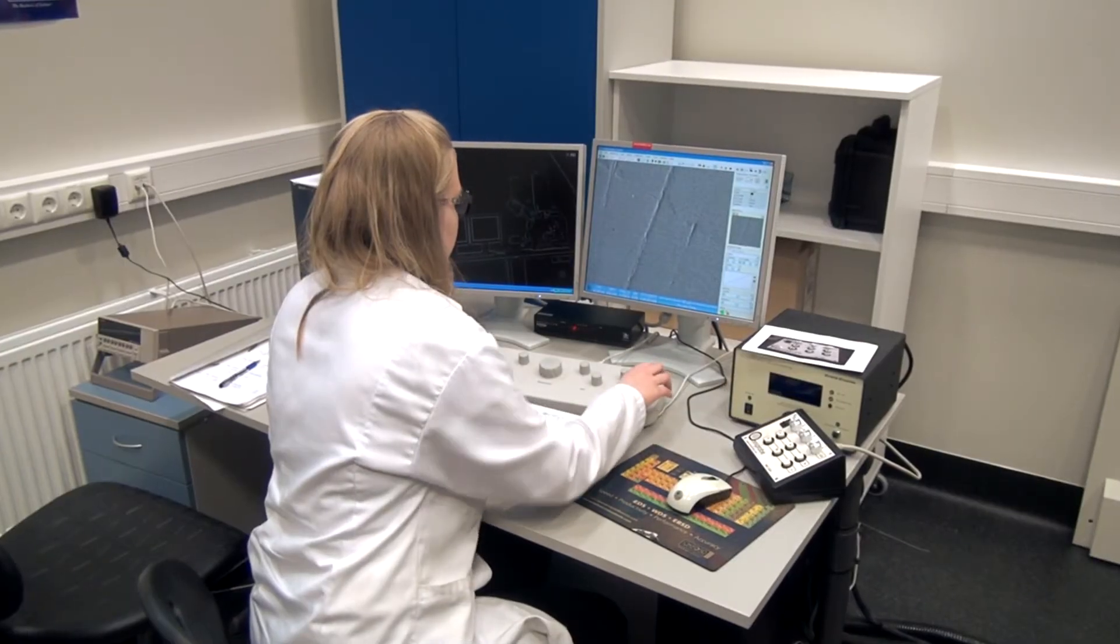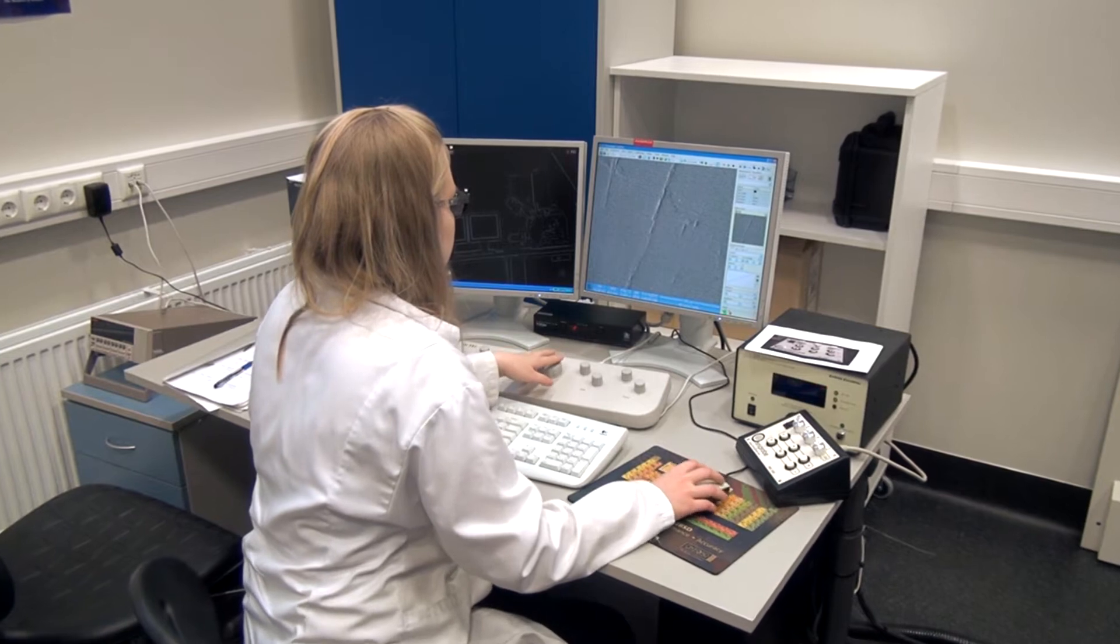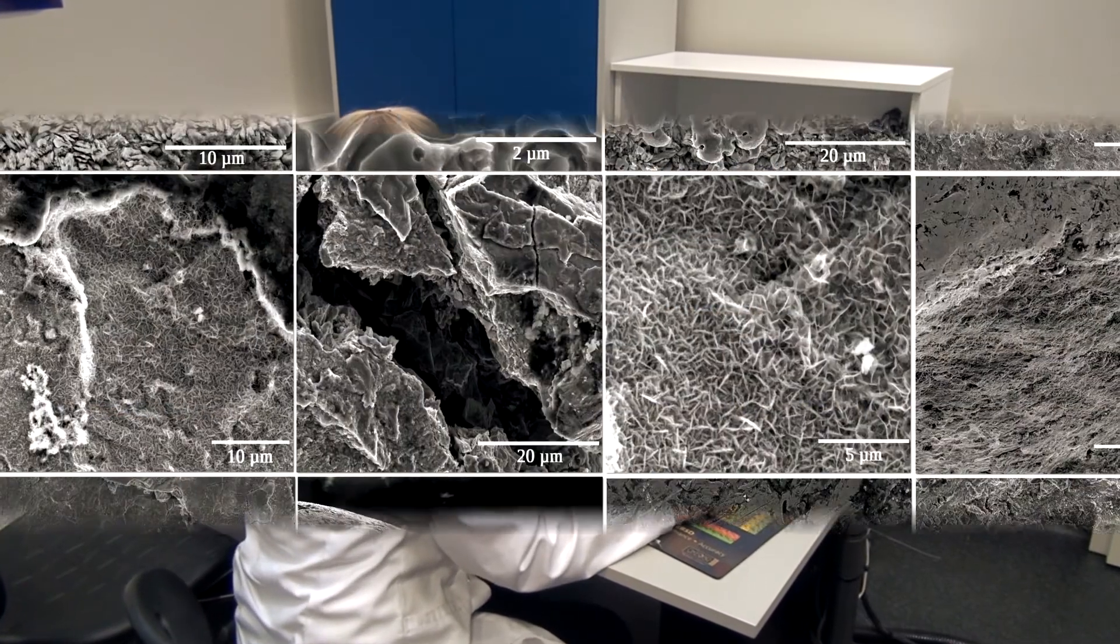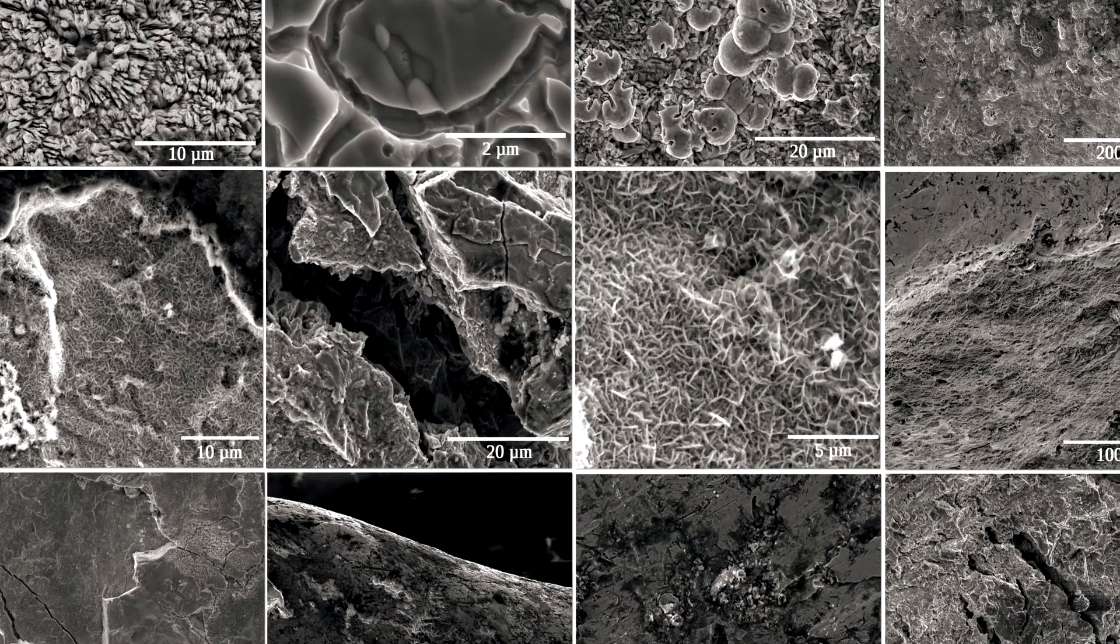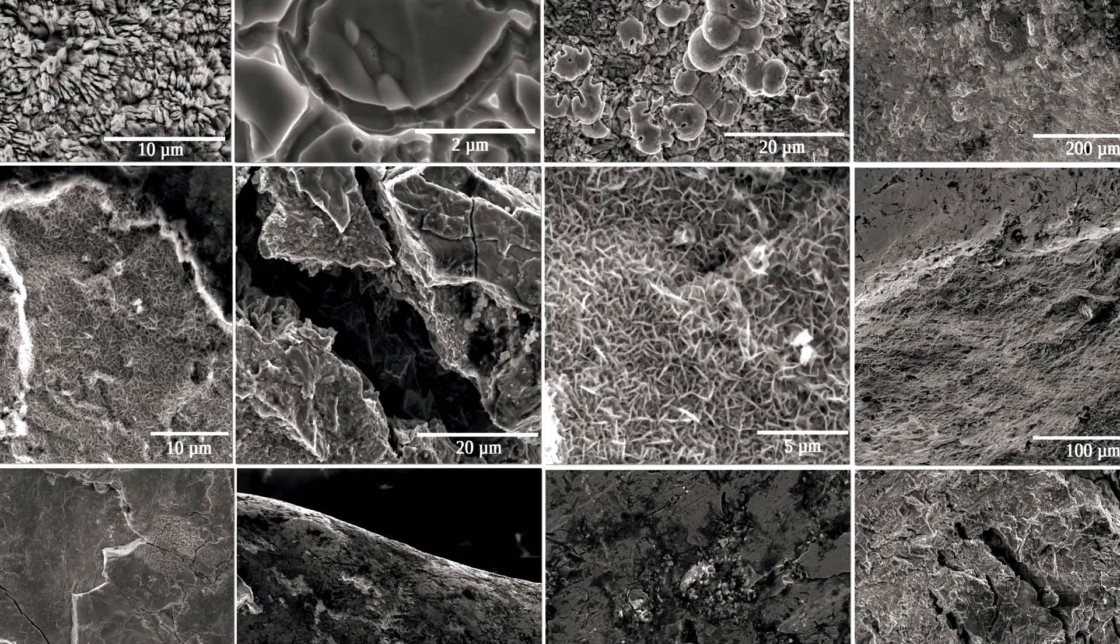Now that the meteorite is back in its natural environment of vacuum, similarly to space, we can take a closer look at its surface. Already at the first glance, we noticed that the surface is covered with peculiar topographic features and each part of the meteorite appears to be completely unique.